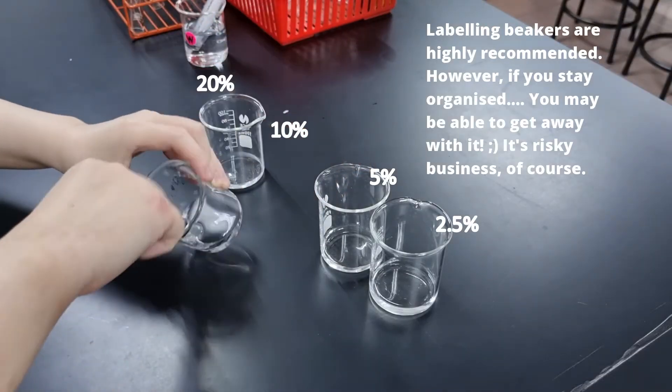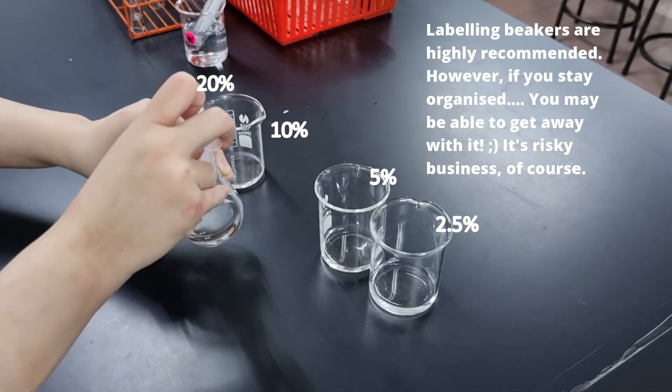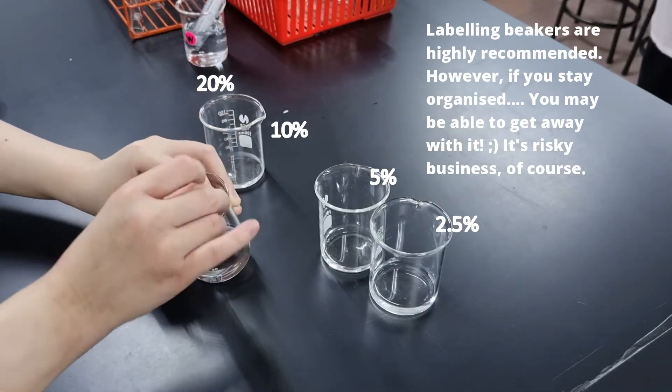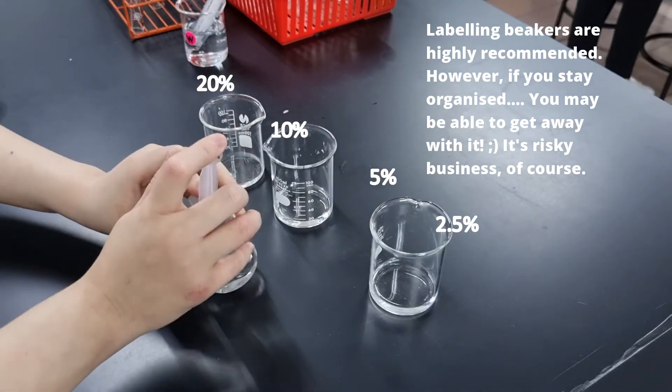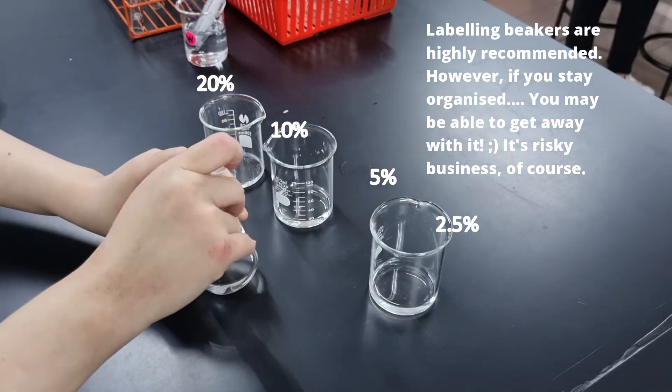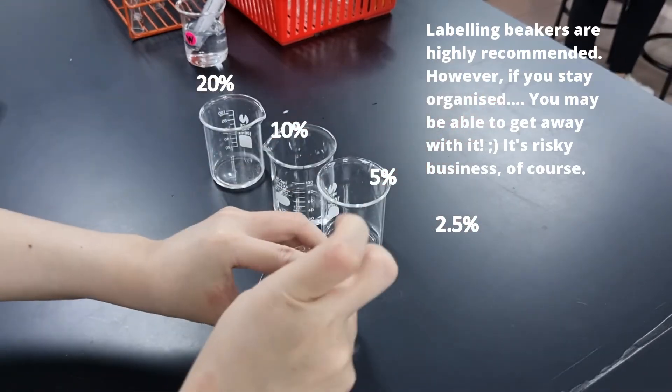So take 10 cm cubed, transfer into the next beaker, and then pipette up and down using the syringe in order to mix properly, and then transfer it into the next beaker. So here we have it for concentrations.